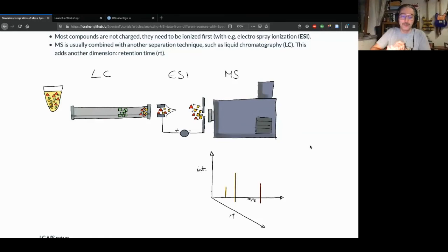What I will explain here is a simple LC-MS setup, how we use this, for example, in untargeted metabolomics. In simple words, we have a sample that has our metabolites, our small compounds in it. The advantage here is that we don't have to break down to peptides. We can simply measure them. This sample is, after sample preparation, injected into the LC, liquid chromatography, where we have a separation of these molecules based on a property that they have.